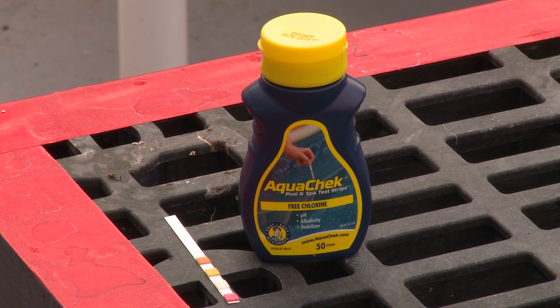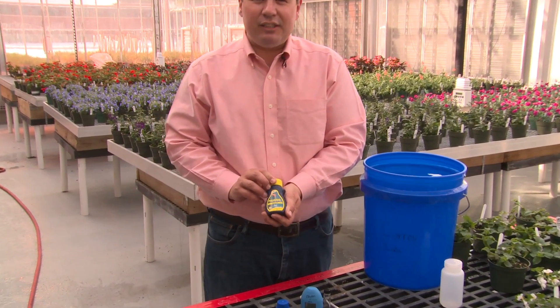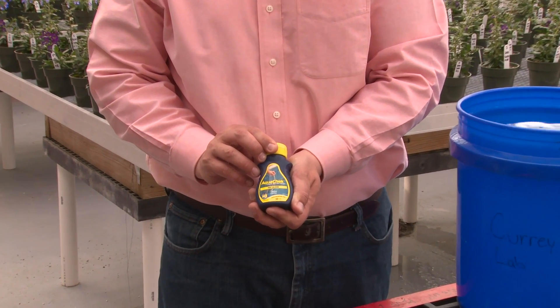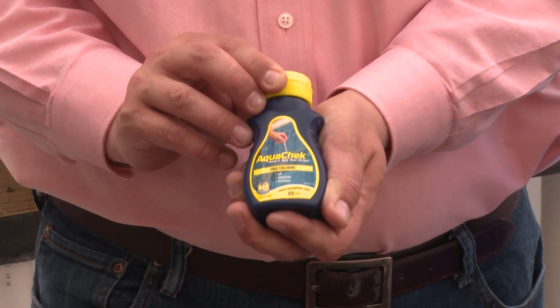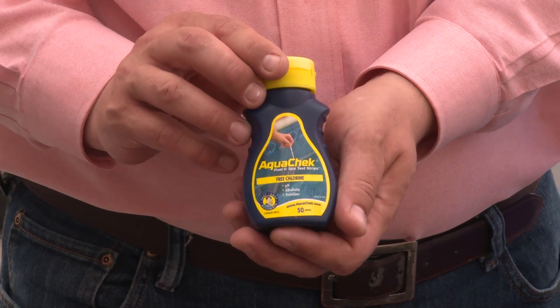We'll start with the simplest method for getting a rough approximation of our alkalinity. You can do this simply by using test strips that are utilized for hot tub and pool water maintenance. These strips will test for things like pH, chlorine levels, as well as alkalinity. While they're not precise, they can give you a rough estimate of the alkalinity in your water.